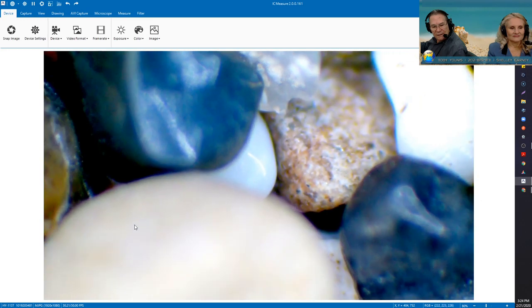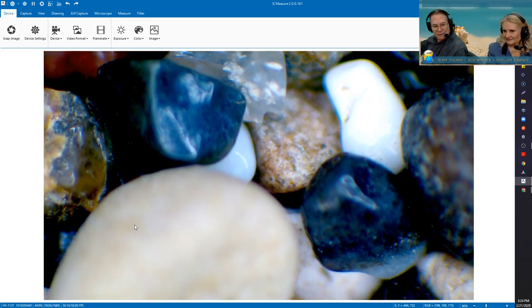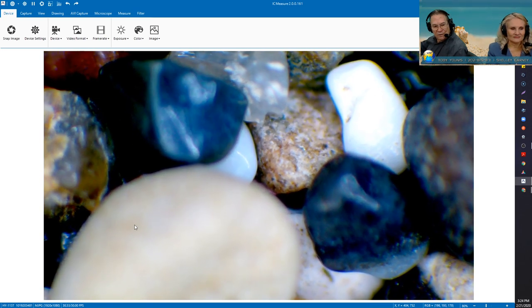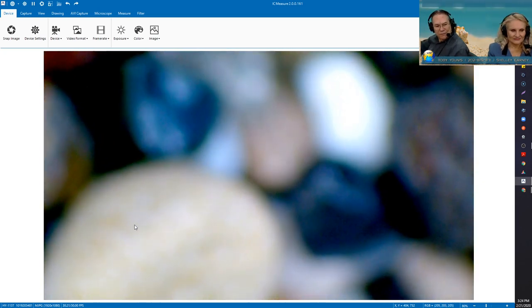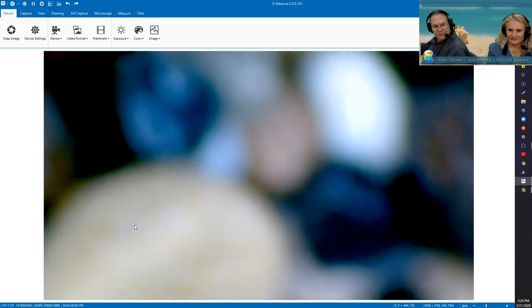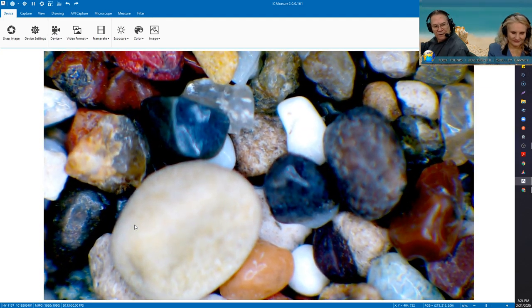They are sand in that they are under 2 millimeters, but just barely under 2 millimeters. They're about to achieve that, so we lose depth of field right away just because of their size. I'm going to push it out even further. Let me zoom out a little bit further, right there. So there's a good selection for you.